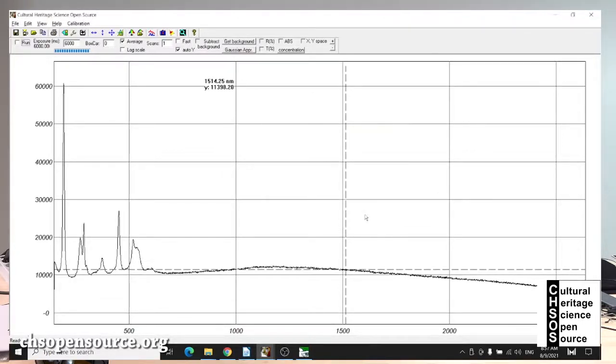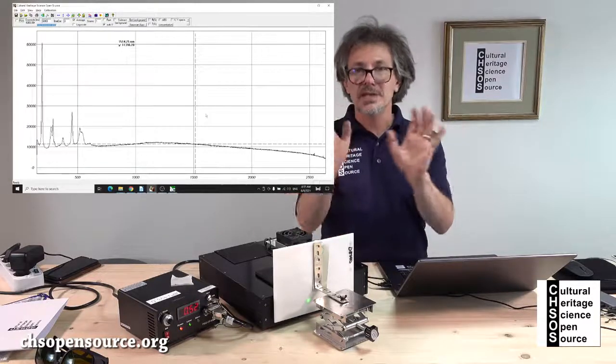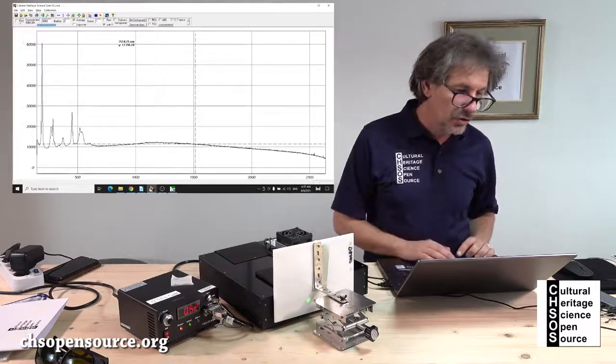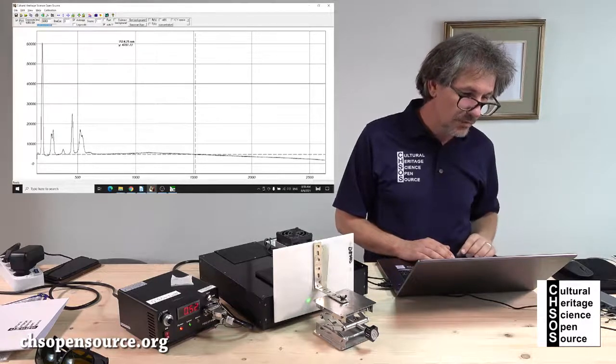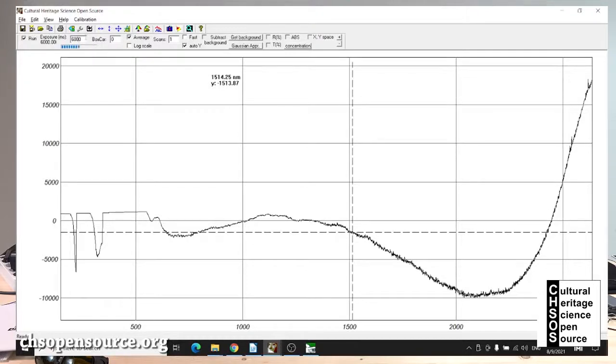And then let's do another experiment using the standard 2x, the intermediate value I ship the spectrometer with. So let's do an acquisition. So this should be overexposed, and then it is, no, because of course we are opening the slit.